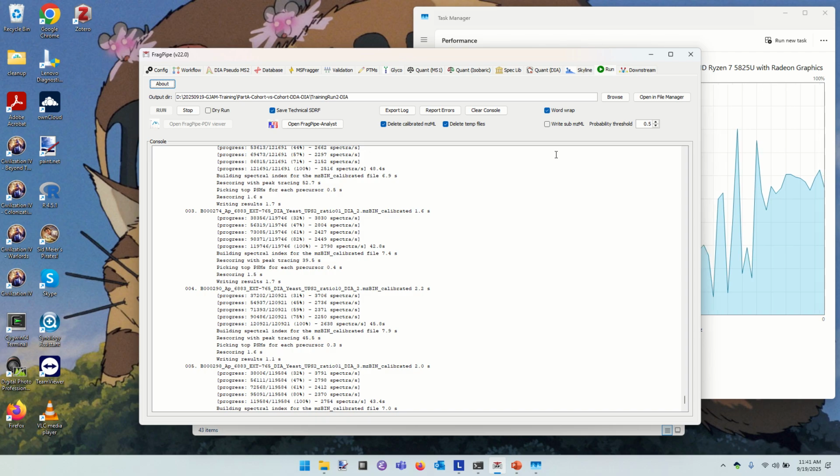Chris, what do you use for DIA analysis most typically? It depends on the purpose. If we're looking for something that will produce like pretty figures out of the box, we use Spectronaut. Because Spectronaut has a robust visualizer. It really does. And very nice QC tools. Yeah, very much so.